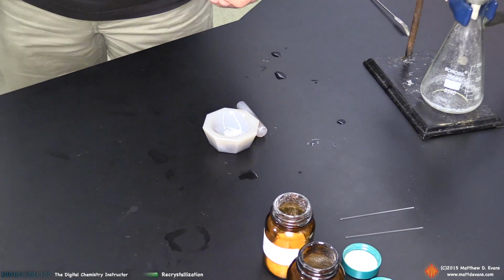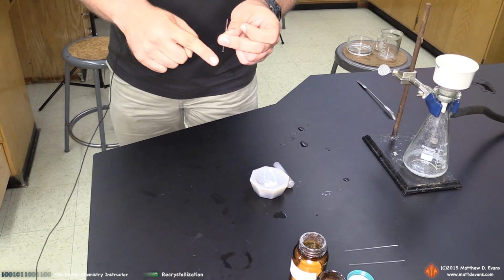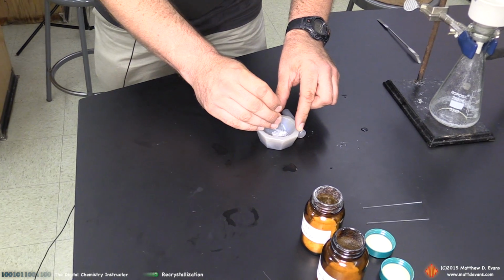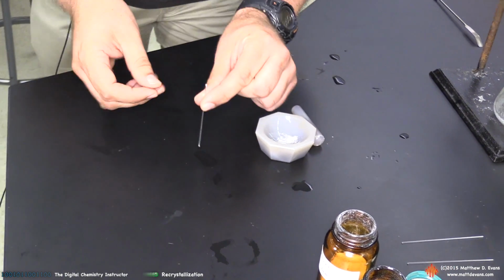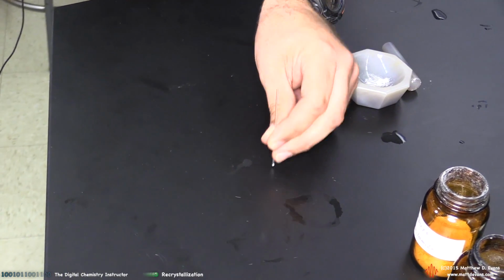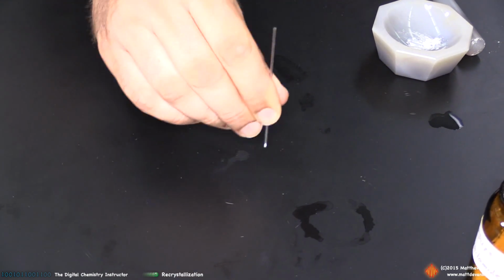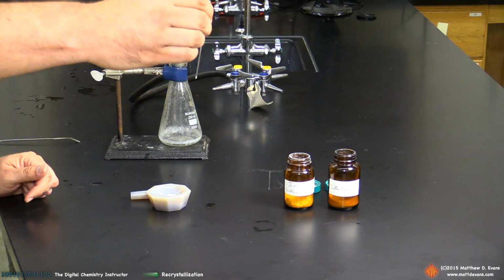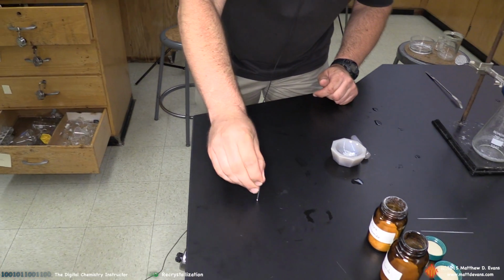This is a capillary tube. These are always available in the rolling organic cart. There's an open end, there's a closed end. Open end, obviously, I'm going to dip just a little bit into the sample. And the golden rule is you're just going to get enough into this capillary tube that you can see it, and that's the golden rule. So if you can see it, it's enough. I'm tapping it down on the bench top just to make sure it's firmly packed into the bottom of this capillary tube. And that's pretty much the perfect amount of sample. One more little pack here.